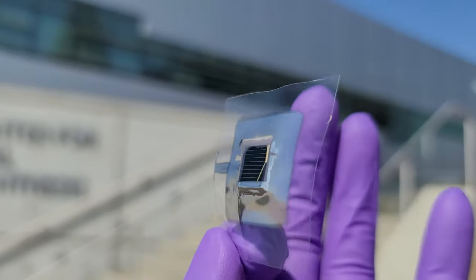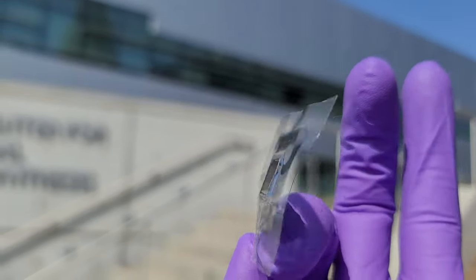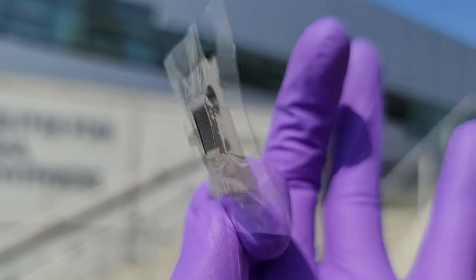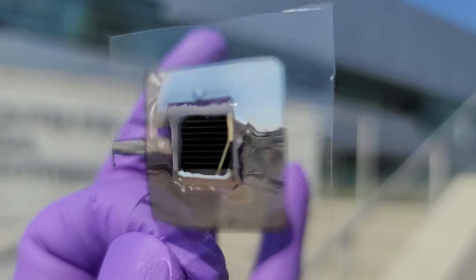After seeing how all the components have been synthesized, tested, and studied, we have finally realized a monolithic solar fuels generator.